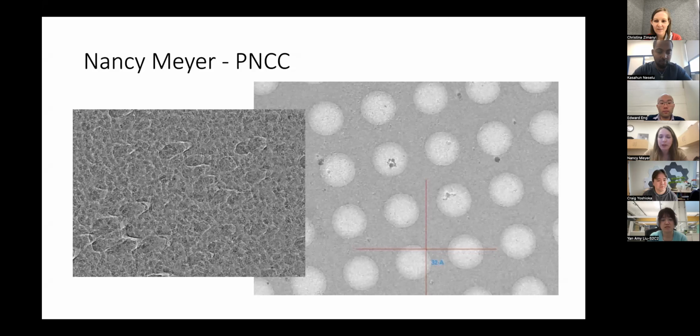from the level of your view magnification in the holes as that kind of salt and pepper speckling. And I often see it in little isolated areas. So I see it at the top in those holes, but then at the very bottom, I see less of it. And so sometimes I can collect in holes that are right next to this really bad ice. So I just want to point out that you should pay attention to what you're seeing in the view mag. It's indicative of what's going on in the holes.